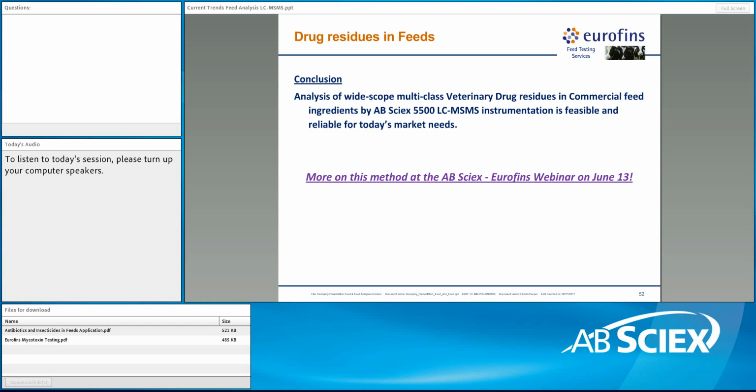So finally, in conclusion, we believe that the analysis of these multi-class drug residues in commercial feed preparations and ingredients by the SCIEX 5500 LC-MS instrumentation is both feasible and reliable for today's market needs.